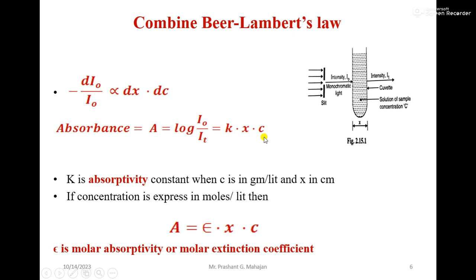Second, we wear dark colored clothes, and we also wear thick clothes, like a sweater. That is related to Lambert's law. Thickness is directly proportional to the absorbance. But generally we deal with only concentration. As you can see, the size of this cuvette is constant. So we keep the thickness constant and vary the concentration. That is called the combined Beer-Lambert law.